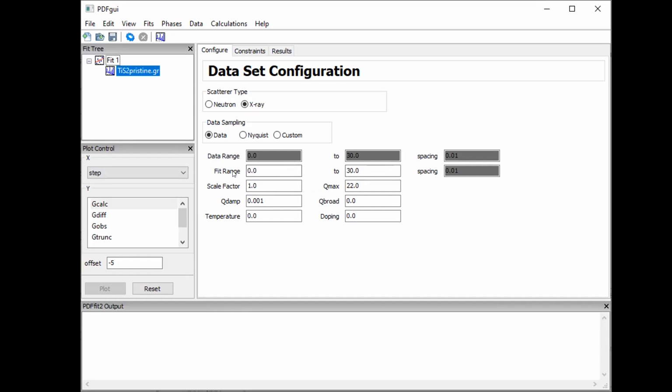For example, let's say you fit a range from 10 to 30, some kind of longer range. But if you fit from, let's say, 1.2 to about 10 angstrom, then you will not be able to get a nice fitting just using the average structure, because the real structure is actually more complicated than what people usually think. And so this is something you can do, in fact, to check if there are local complexities, right? You can set this range to some small number.